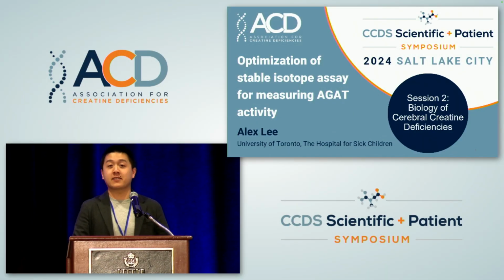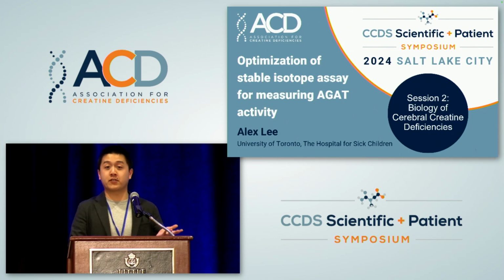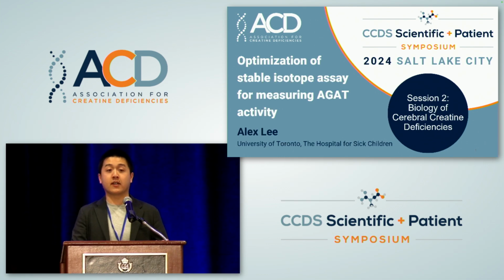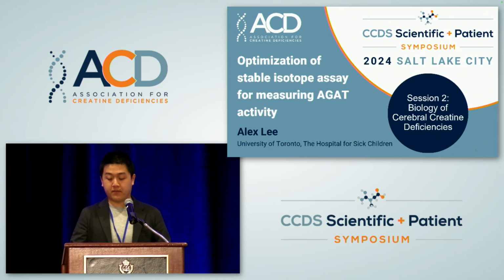Introduction, as mentioned, my name is Alex, and I'm a graduate student in the lab of Dr. Andreas Schultz. And today, I'll be presenting one of my projects, which is the optimization of a stable isotope assay for measuring AGAT activity.